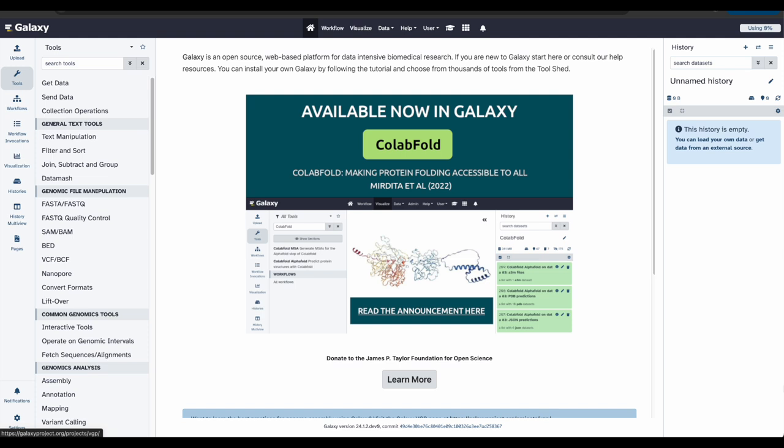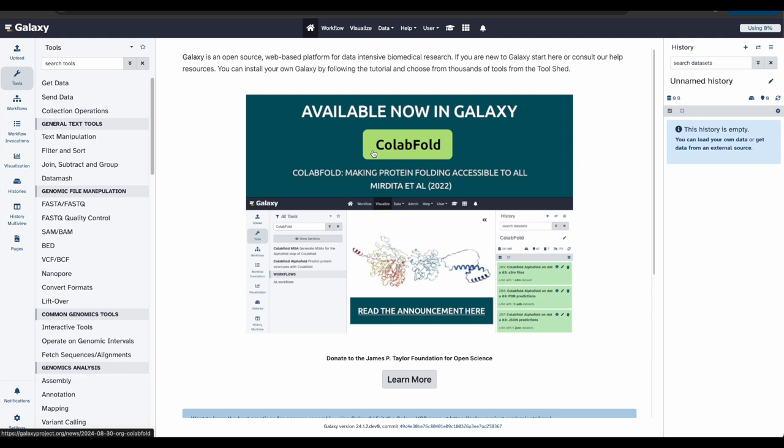Let's get started. Once you have logged into the Galaxy instance of your choice, I'm using usegalaxy.org, your Galaxy interface will look something like this. Here, you can see the activity bar and tools listed on the left. The analysis history is recorded on the right, and the center panel will let you run analyses and view outputs.